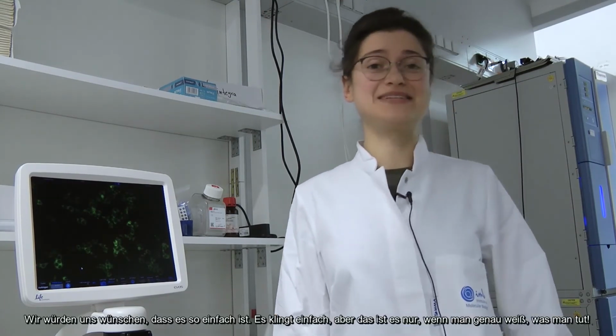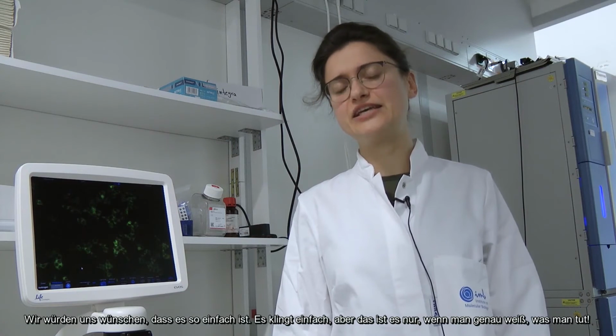Wow, sounds so easy. Are there any difficulties? Well, we wish it was so easy. It does sound easy, and it is an easy technique once you know what you're doing. The most tricky part is to select the right cell type that you want to study. Then you have to be really sure about the sequence that you want to bring in and to design properly your constructs.